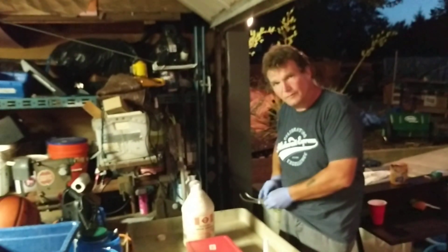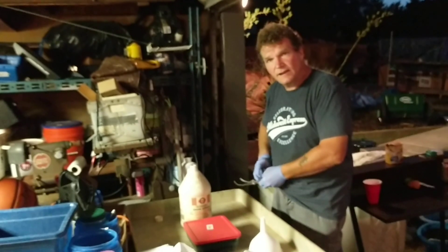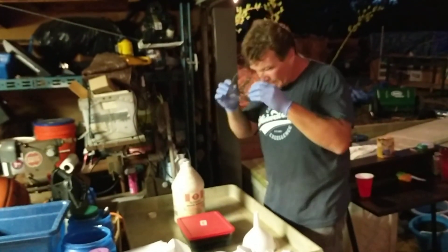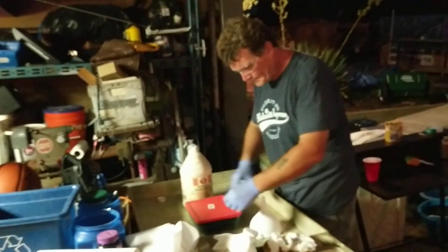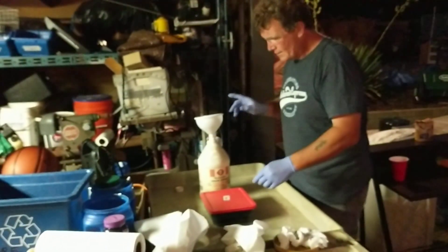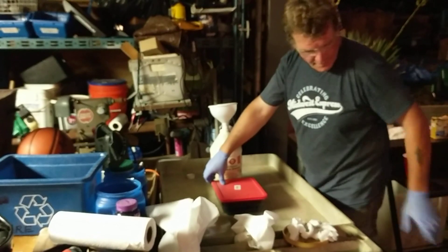My glasses keep fogging up on me here. So now I'm getting ready to start — I've already wiped out my funnel, I've got everything down here prepared.